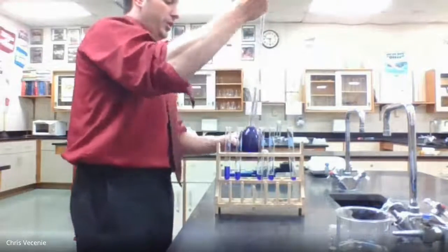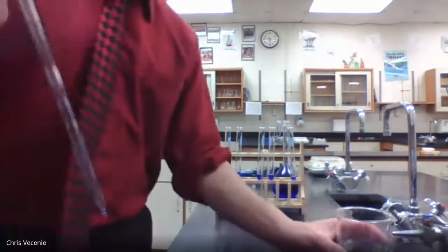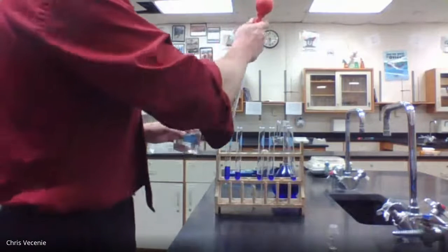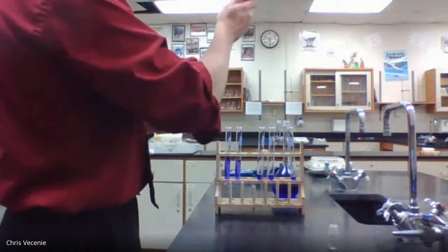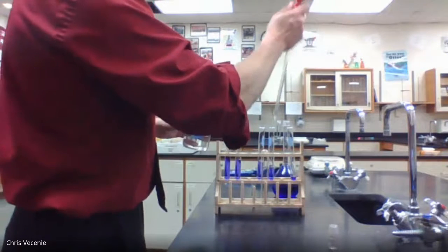All right, then what you would do is you would clean this guy out. Okay. So I go over here, rinse them. And then I would get the appropriate amount of water for each of these guys. Okay, so we draw that up in, and then we fill this guy with the 5 milliliters of water, and then the right amount of water for this guy. Go back in, right amount of water for this guy, the correct amount of water for this guy.